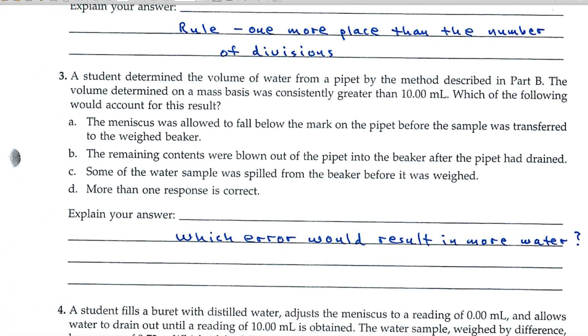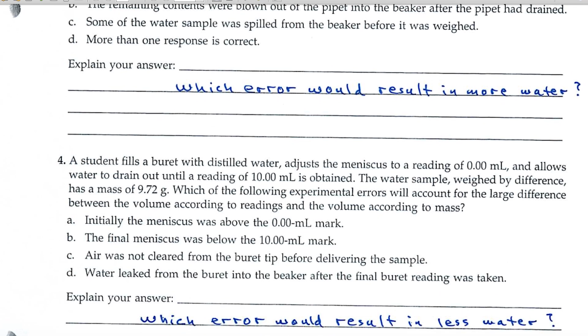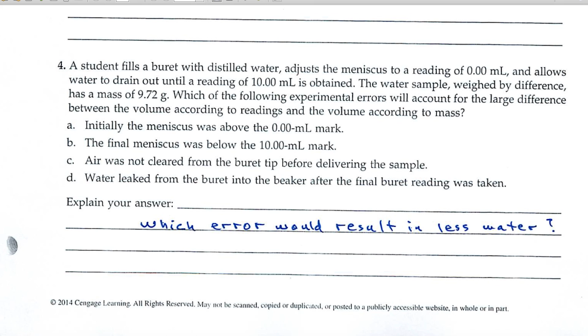Number three starts a series of hard questions. And here's a little tip. Which of these errors in A, B, and C would result in more water? Tip for number 4, which error in A, B, C, or D would result in less water?